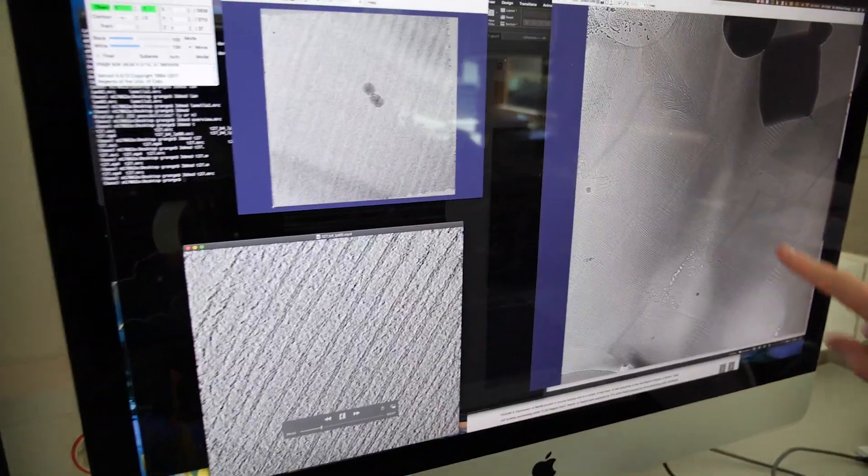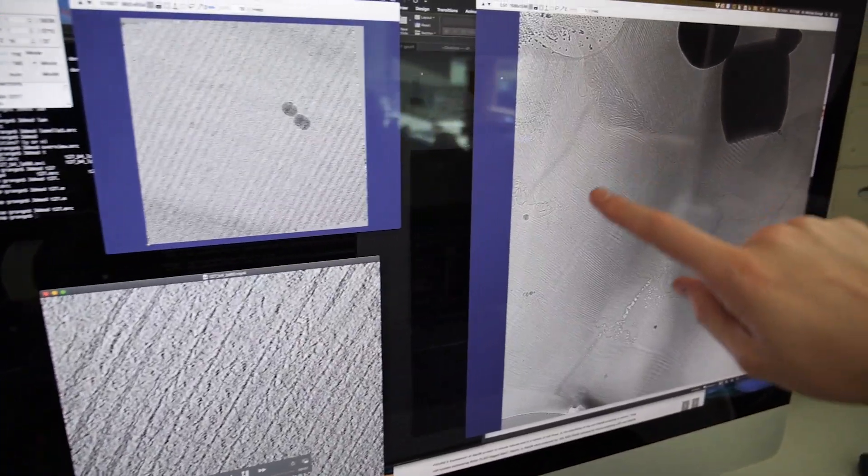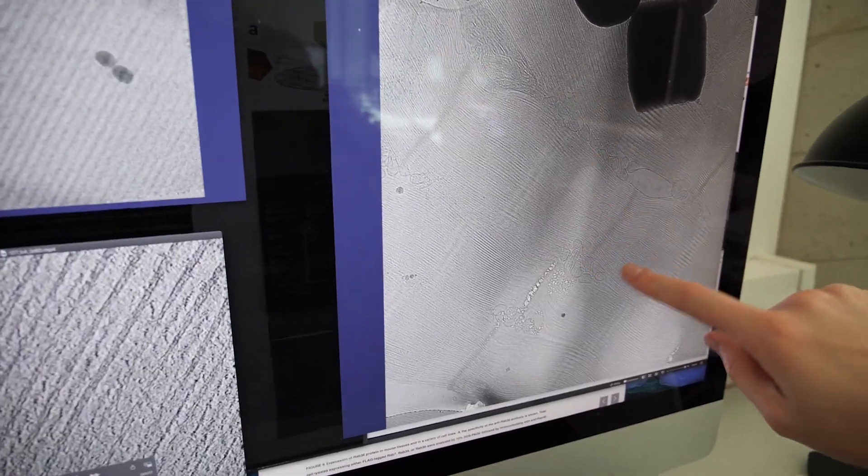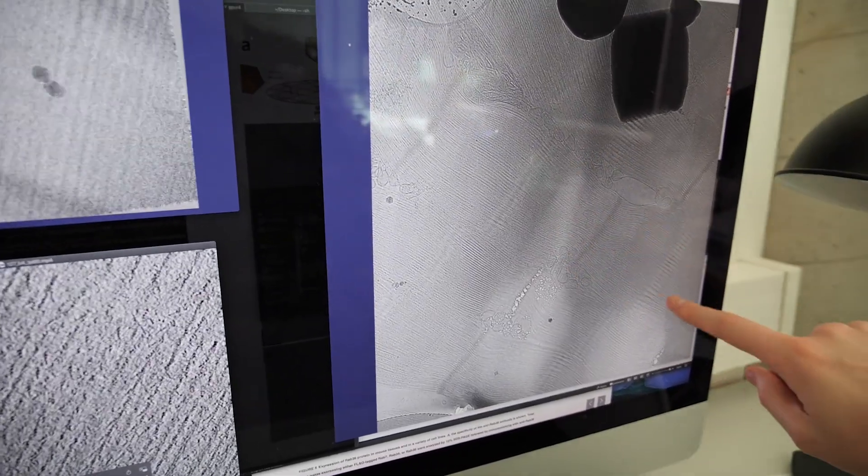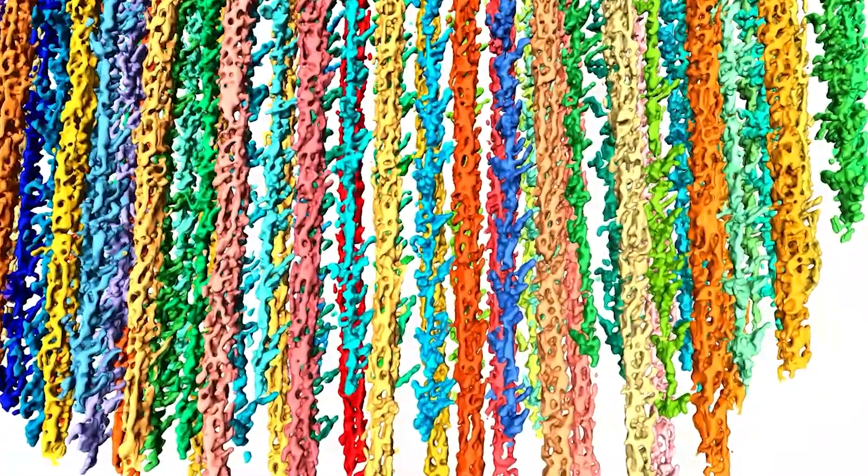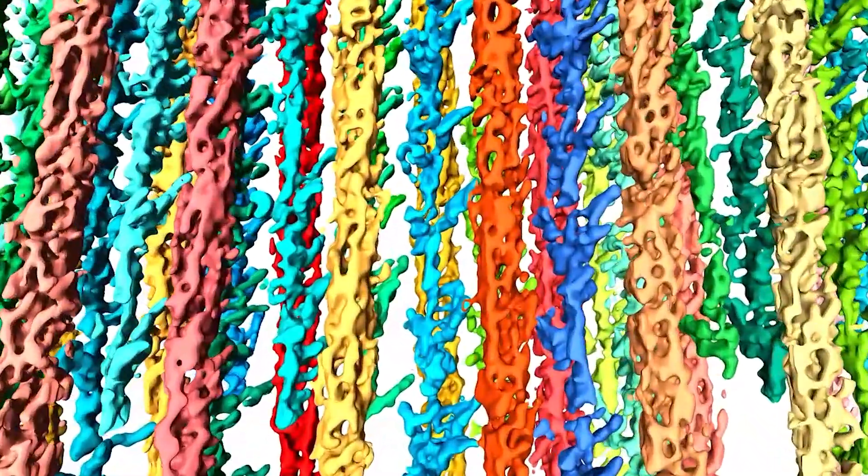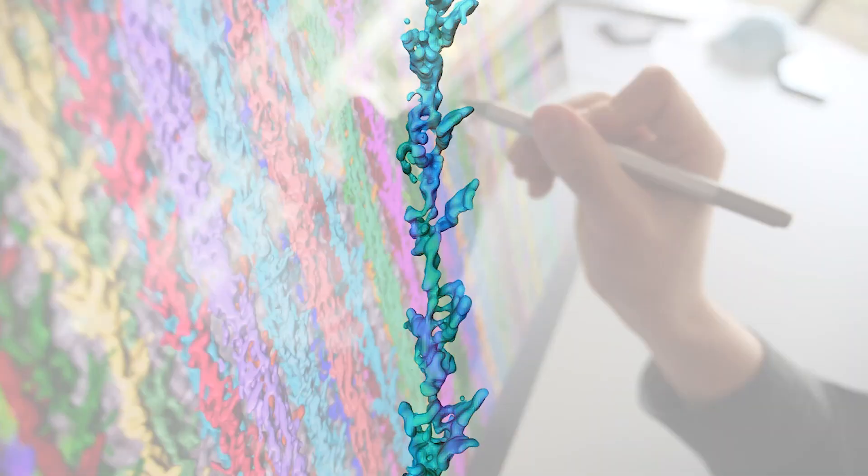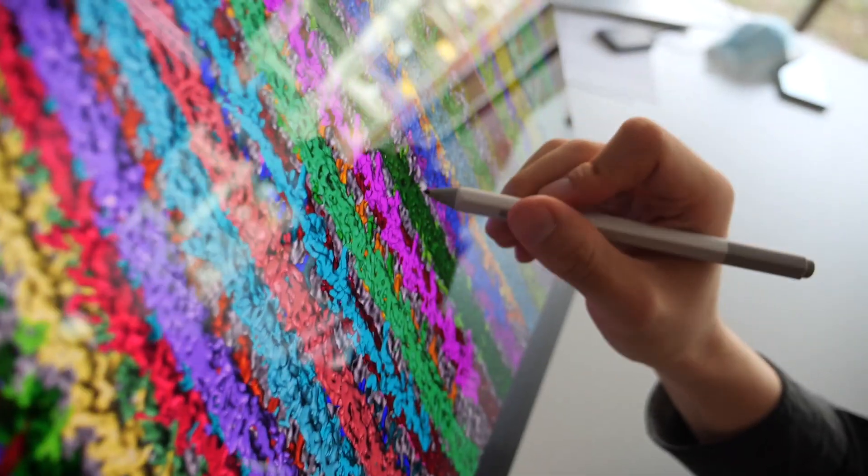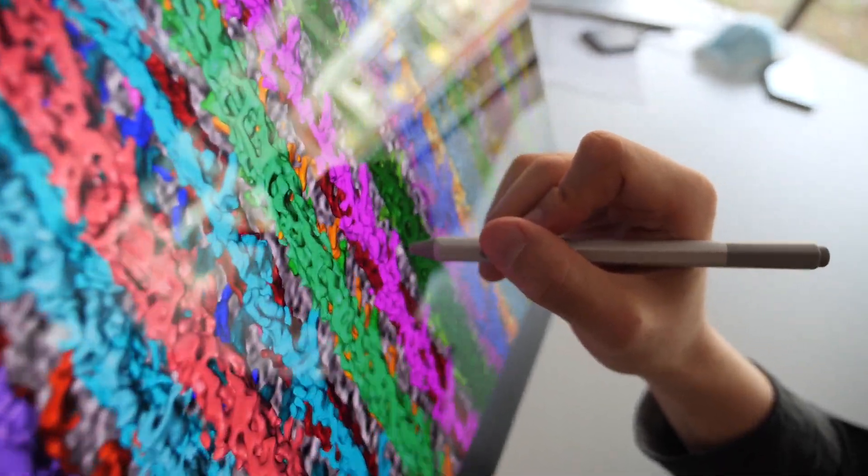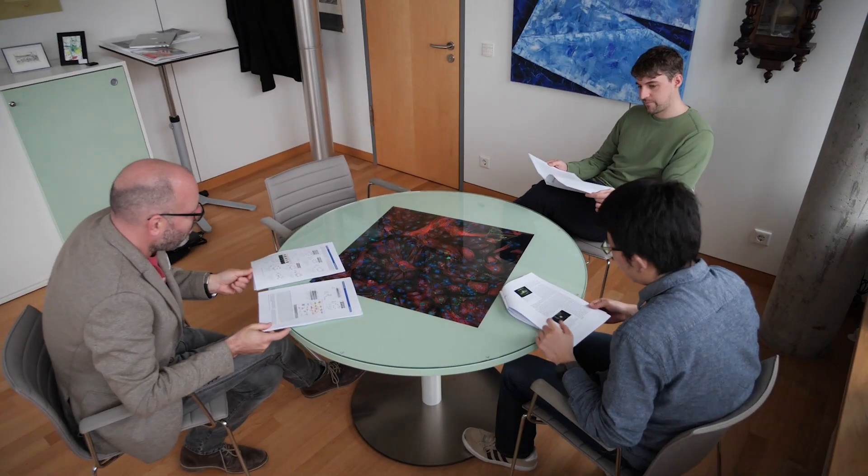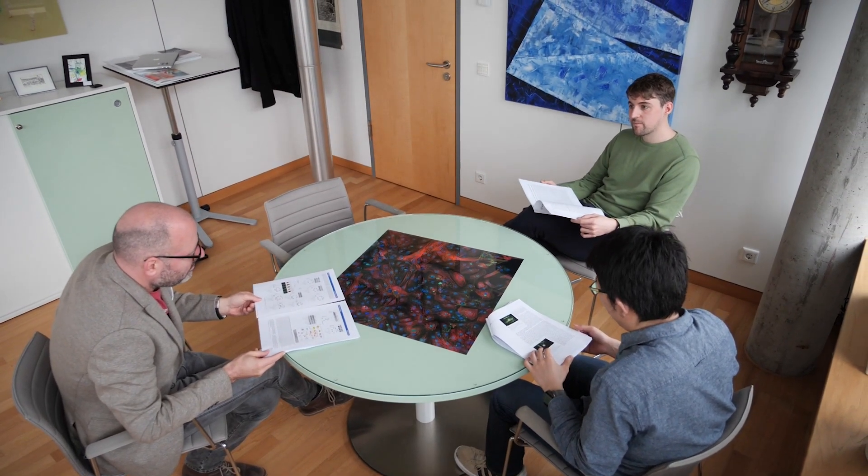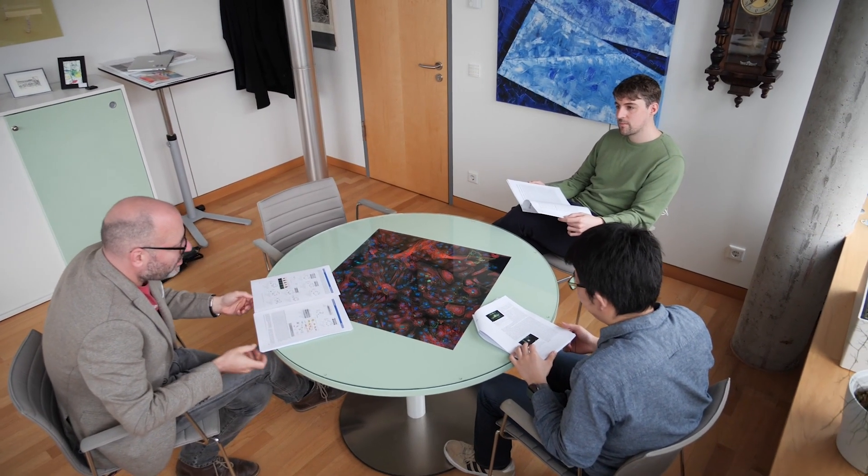We can do this then at multiple positions on a lamella or multiple lamellae, and build up a 3D dataset which is then used for subvolume averaging, which is a technique used to align and reinforce regular features visible within our data so that we can gain more information on their molecular structure.